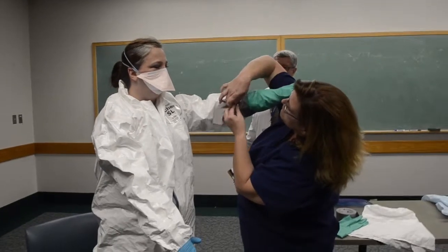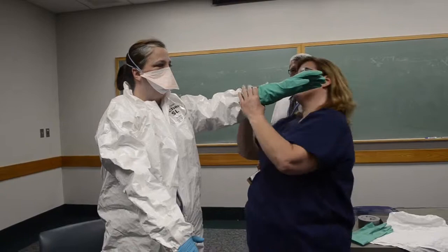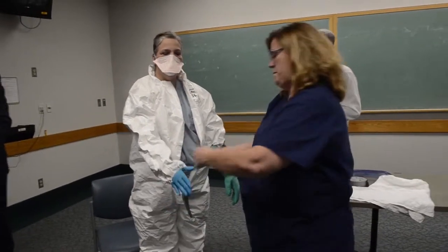Typically donning and doffing — what you're putting on or taking off — is PPE. It can take anywhere between 25 to 30 minutes. Speed is not a good thing here; you make sure everything's done very methodically.